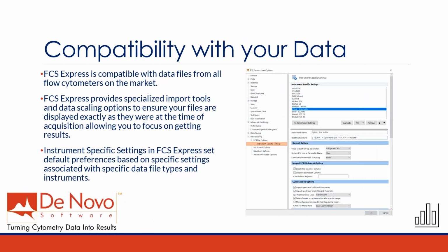So let's talk about compatibility with your data. FCS Express is compatible with data files from all the flow cytometers on the market. So you're not going to have to worry about, oh my gosh, can I use this for my data set? Yes, you can bring it into FCS Express, and we're going to be able to reflect those scaling options and how things look in your acquisition software. We have a lot of tools in FCS Express to make sure that you can get that same view. So you're not going to spend a lot of time getting oriented in your data. We can offer those tools right up front.